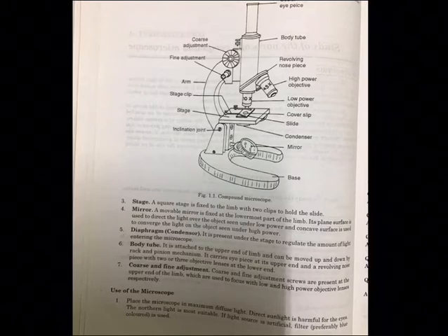And then the diaphragm. The diaphragm is present under the stage to regulate the amount of light entering the microscope, so that controls the light. And then the body tube. It is attached to the upper end of the limb and can be moved up and down by a rack and pinion mechanism. So you can move this body tube up and down.